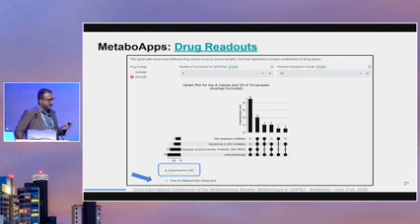And then the analogs are excluded for this one, and you have the number of samples in which those are present. And as I said before, you can already download these as an SVG image, so that you can change colors or anything in any editor that you're used to working with.